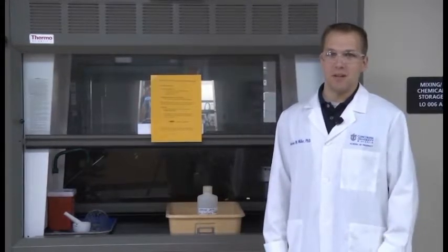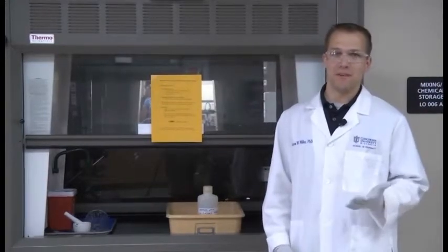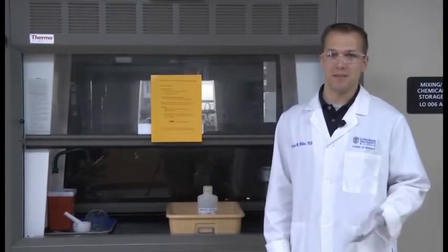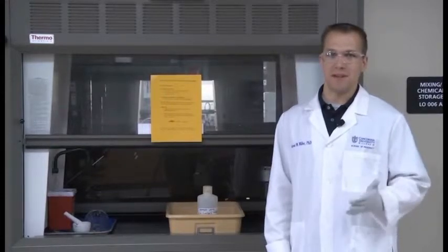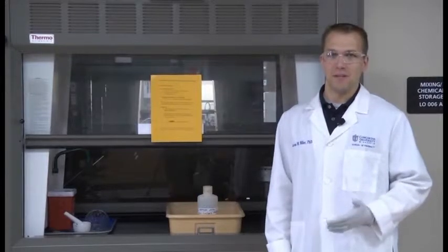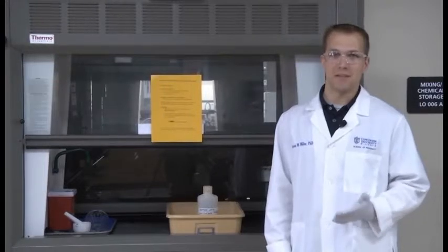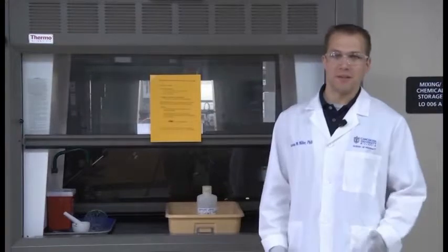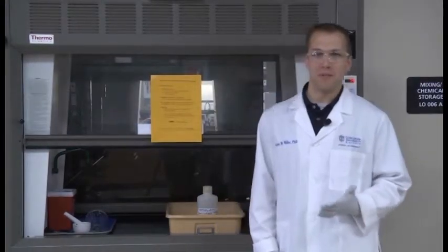And this is where hazardous waste procedures come in. So with hazardous waste, there are very few things where we can look on a list and actually see something listed as a hazardous waste. The government publishes a list of a very limited number of chemicals that it defines as hazardous waste. Other things, though, are defined as hazardous waste through their characteristics. So if something is flammable, if it's corrosive, if it's reactive, or if it's toxic, it's automatically classified as a hazardous waste. So most of the things that we come across working in the lab are going to be hazardous waste because they meet one of those characteristics.